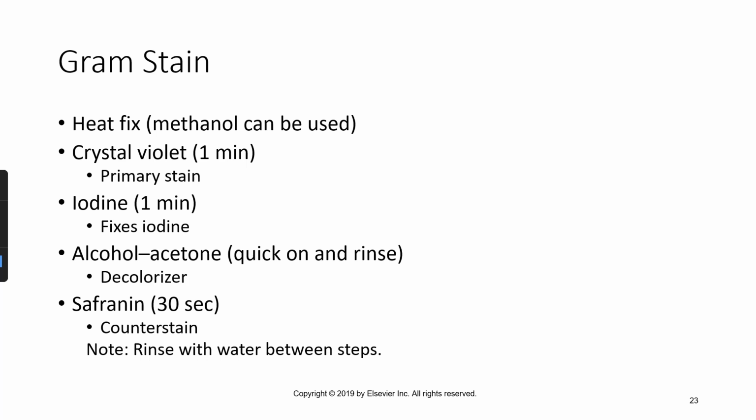In this course, we're going to be doing gram stains as much as possible because the more gram staining experience you get now, the better you're going to be at it once you get out into your clinical placement or even into your career.